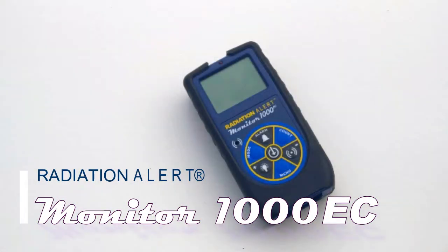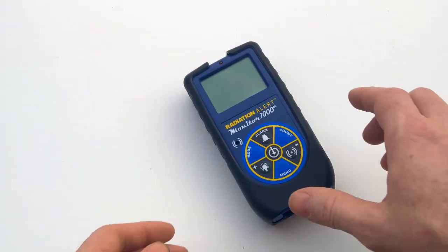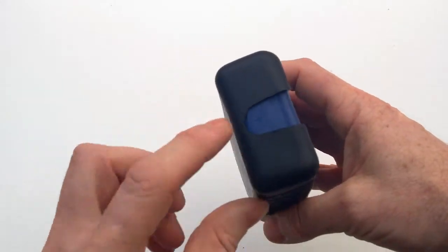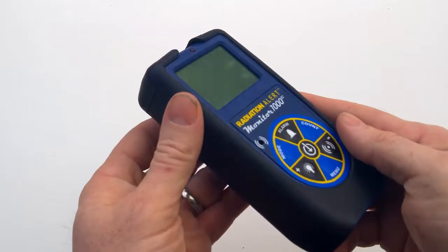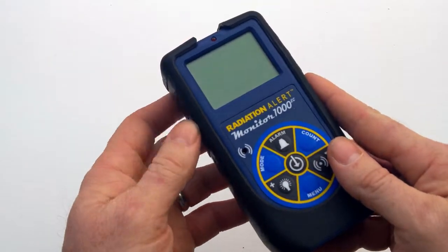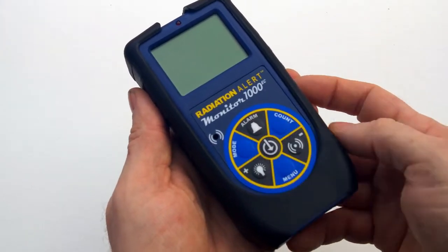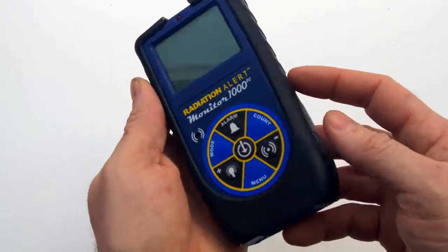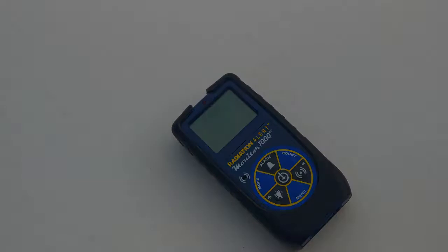Hello and welcome to the Radiation Alert Quick Start Guide for the Monitor 1000 EC radiation detector. The Monitor 1000 EC is an energy compensated ionizing radiation detector that detects gamma and x-ray radiation. The detector location is marked on the top above the LCD. It has a ruggedized overlay, a graphic LCD for displaying the readings, and seven membrane buttons on the front for one-touch operation, as well as Bluetooth and a mini USB jack on the side for use with our free Observer software and apps.